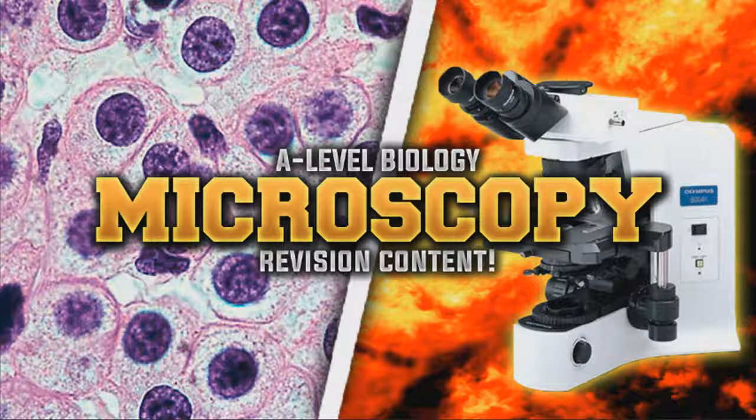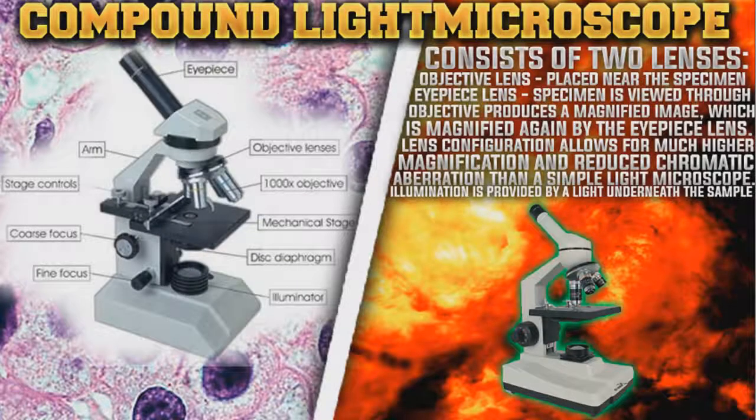The first thing we're going to look at is the microscopes. The first microscope we're going to be looking at is called a compound light microscope. This consists of two lenses. You've got your objective lens, which is placed near to the specimen, and you've got your eyepiece lens, which you view the specimen through, so you put your eye on it, as the name says. These two lenses work together. The objective lens magnifies the object, and then the eyepiece lens magnifies that image further, so you get a really nice magnified image.